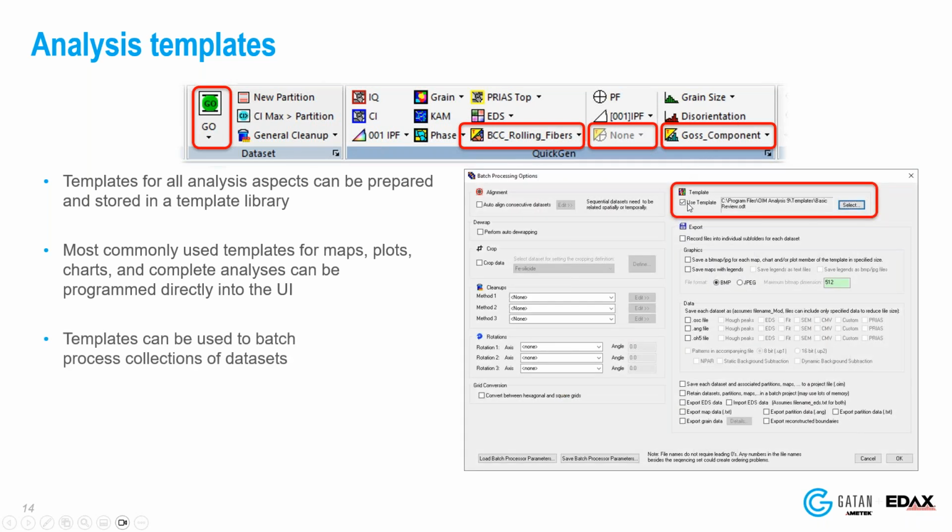These templates can then be used for batch processing, as I mentioned. So there's the batch processor. You can do some general applications. You can do a cleaning if you want to. Please be very careful with that. Don't do it too much.